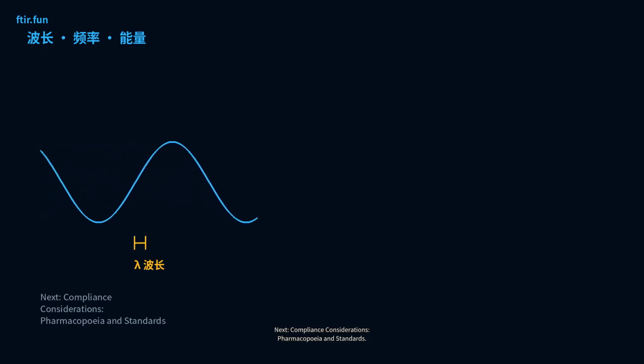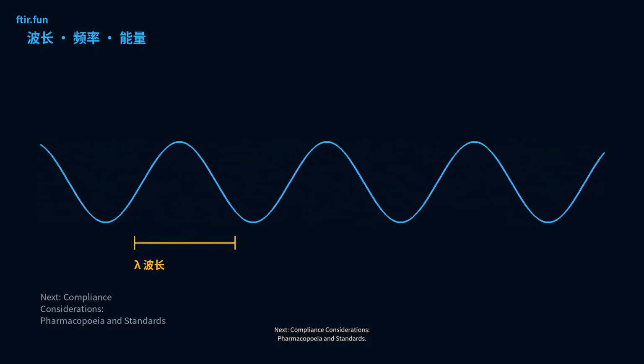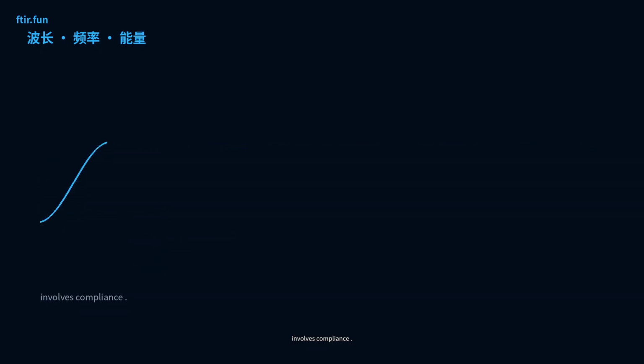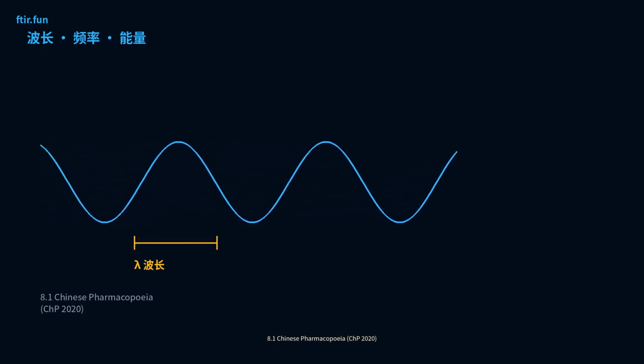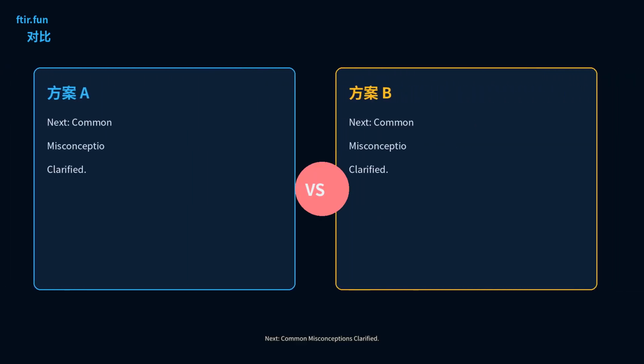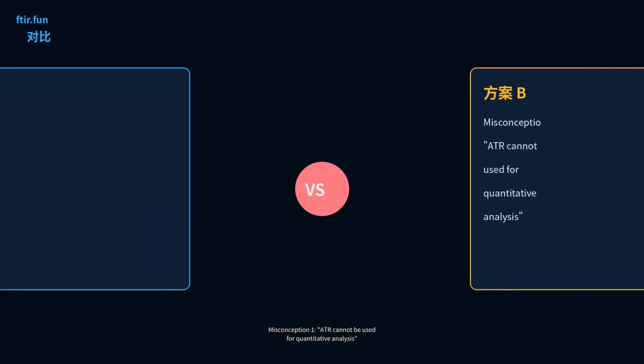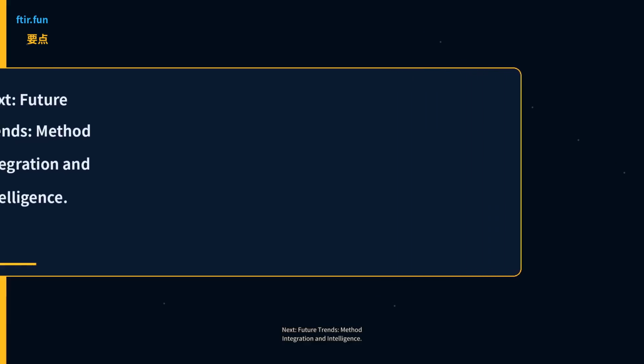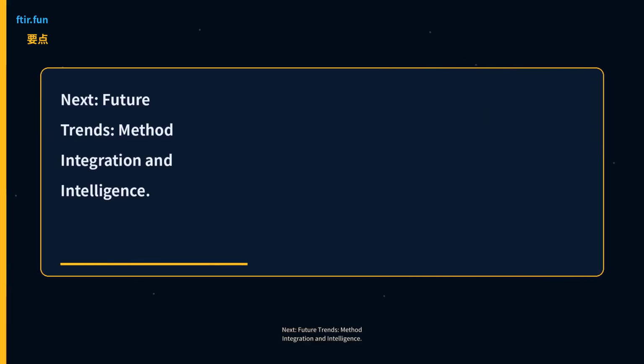Next, compliance considerations, pharmacopoeia and standards. Method selection is not only a scientific issue but also involves compliance. 8.1 Chinese Pharmacopoeia, 2020. Next, common misconceptions clarified. Misconception 1: ATR cannot be used for quantitative analysis. Partially correct, partially outdated.